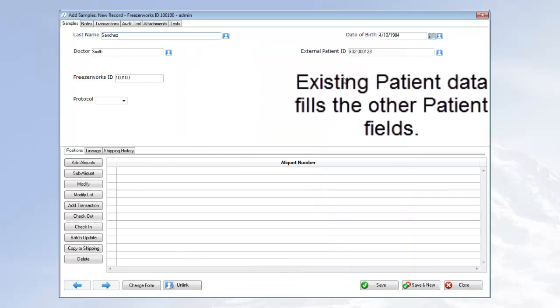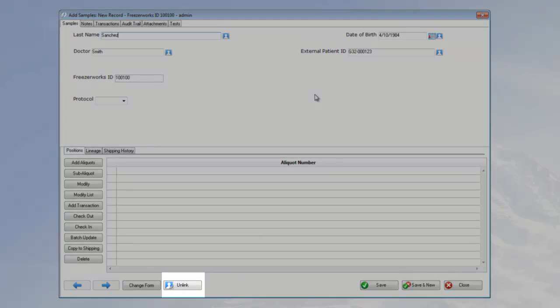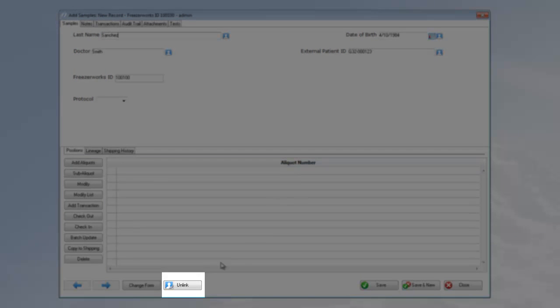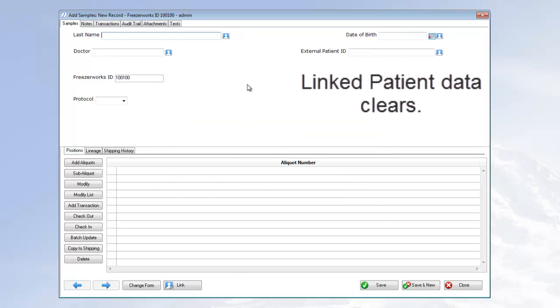Now, at any point you can choose to unlink the sample from the patient and clear the patient fields of their data. Just click the Unlink button at the bottom of the form. Click OK on the confirmation to continue. Watch as all the patient data clears from the form.